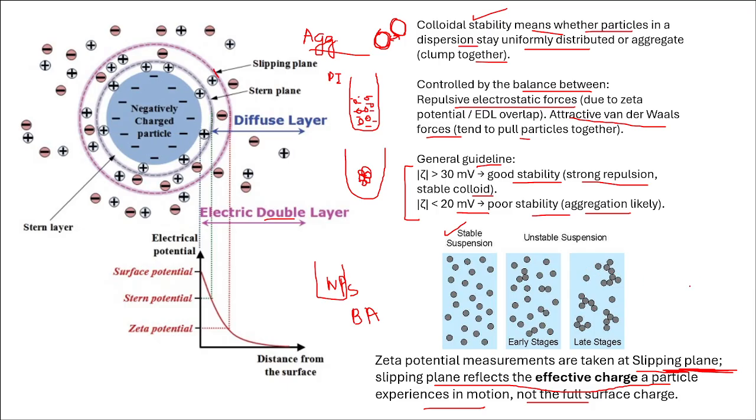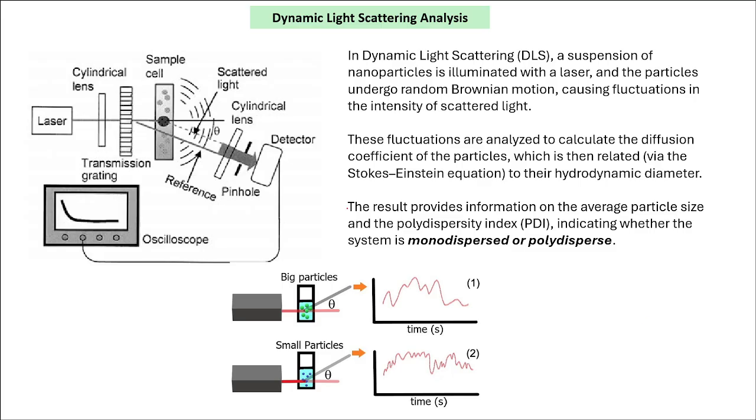So whenever you are synthesizing nanoparticles, you should ensure that they have excellent colloidal stability as well. What is meant by colloidal stability is that it is not coming together, it is not aggregating. So it's very important. Now, how do we determine this colloidal stability? By the analysis that we call dynamic light scattering analysis, or in short form, DLS.